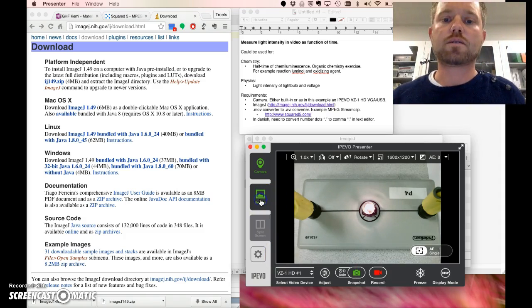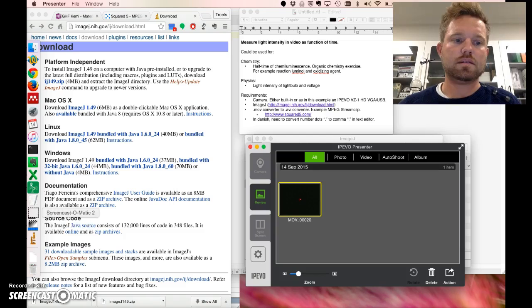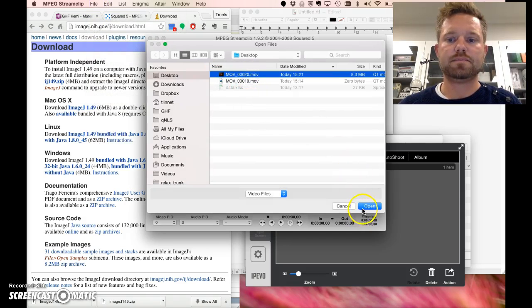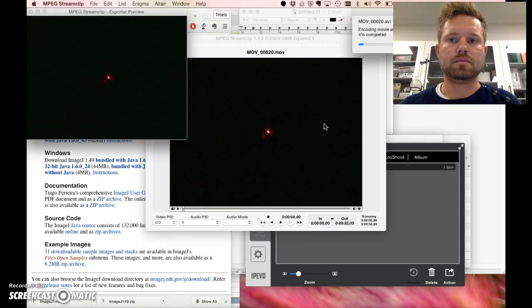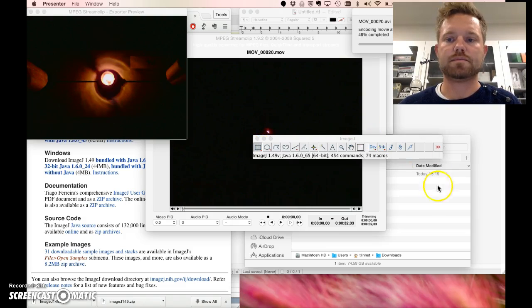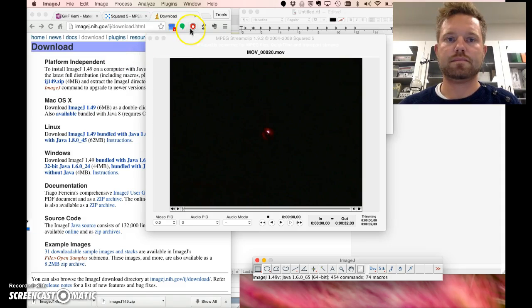Good. I'm going to export this just onto my desktop. This was number 20. I'm opening this one, the converter. Open file. Number 20. And right away go up to File, Export to AVI. Just the same. Meanwhile, I can close the other applications. Very good.